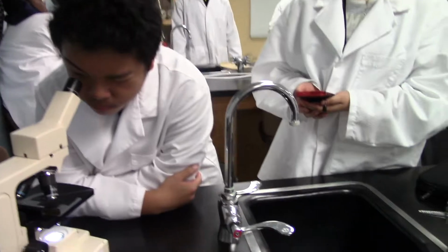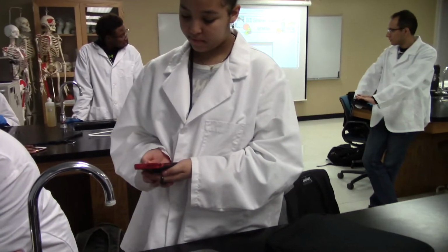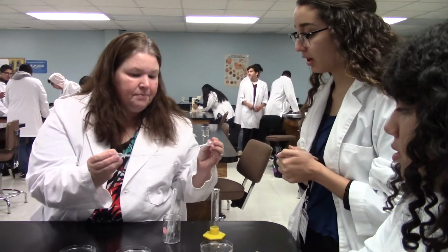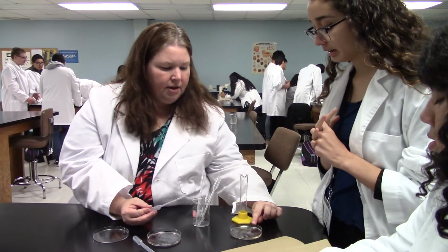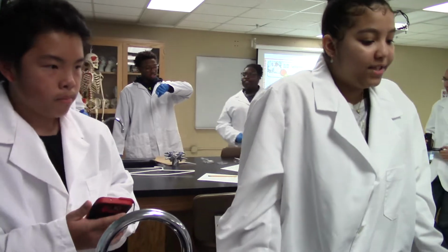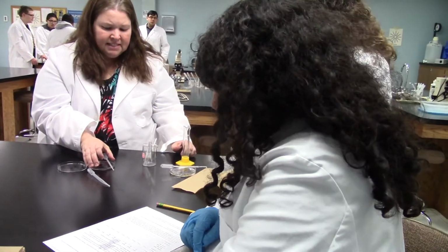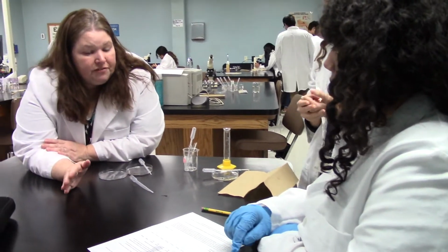Did you guys get one in? Oh yeah, that's right. When you're trying to get them in the capillary tube, use these two thinner pipettes. Make one the sugar one. Is that sugar water already in there, or was that regular? You put 15 milliliters? Okay, so use one of these for sugar, and use one of these for putting them in the capillary tube. That way you'll always have a thin one, because it is a little easier. Okay, so now, 15 in 1 minute.